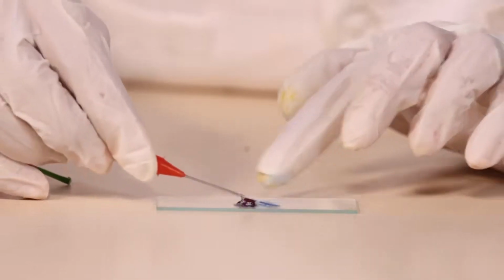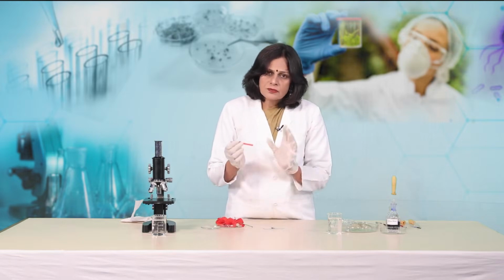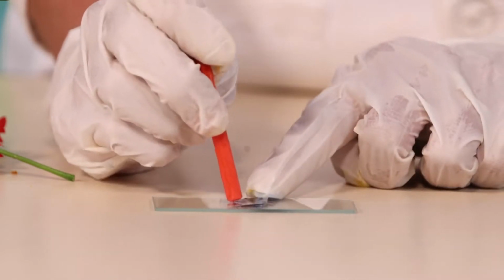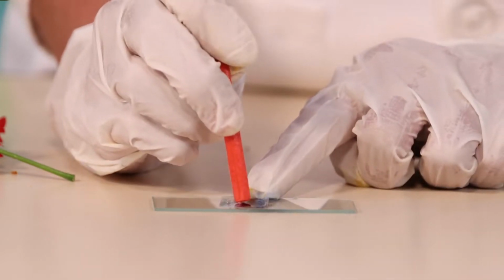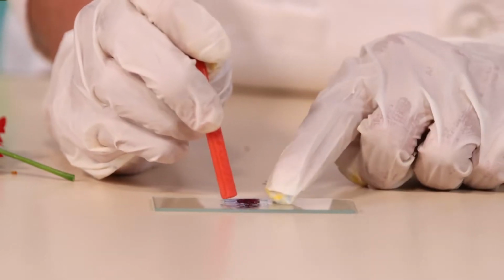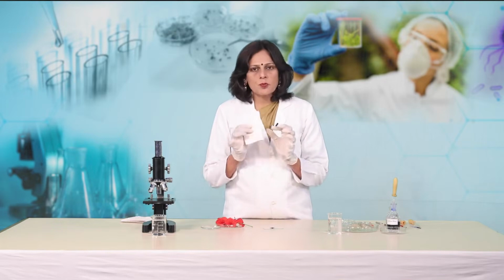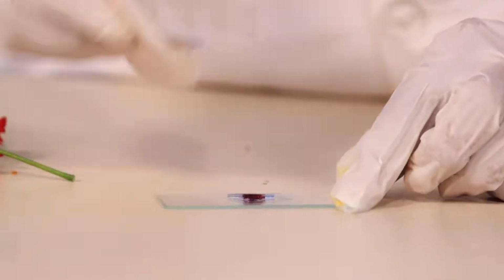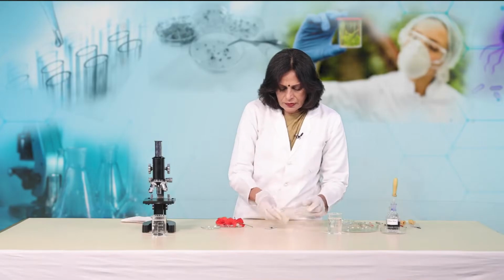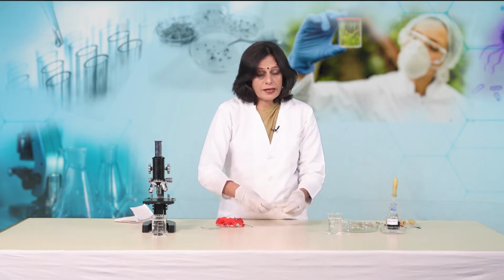And actually now we should give a gentle pressure with the help of the back side of this needle. So, it will be something like this, right, so that the stigma along with the portion of the style gets a little pressed. Again we will use this blotting paper to remove any kind of excess stain or the mountant medium. Now, we are going to focus this slide under the microscope.